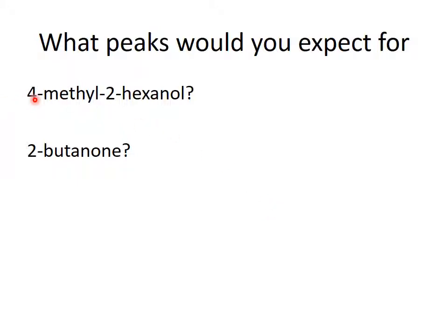So what peaks would you expect to see for 4-methyl-2-hexanol and 2-butanone? Try to use your understanding of alpha cleavage primarily, and other rearrangements or cleavages that would give you peaks in these molecules.